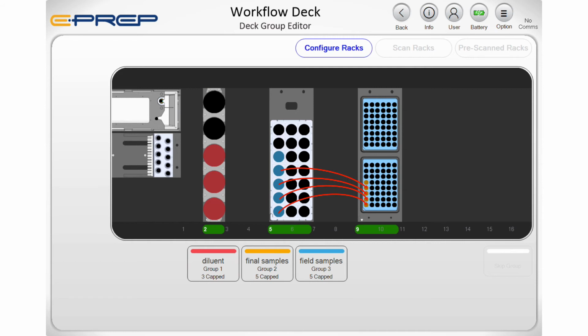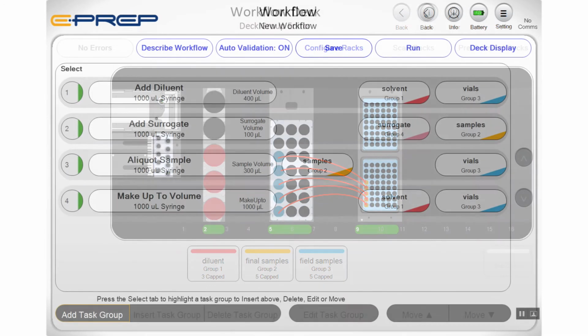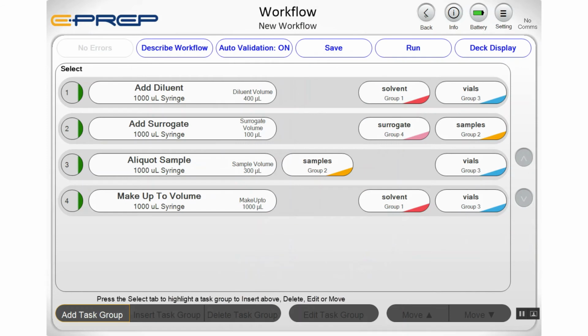The reason for this is with the Aliquot Sample task, in the original containers containing the sample, there might be different volumes in each of the containers. For example, if they've just come straight from the field. You will notice that the location of the input tubes for this task is slightly offset from the other input tubes for this reason.